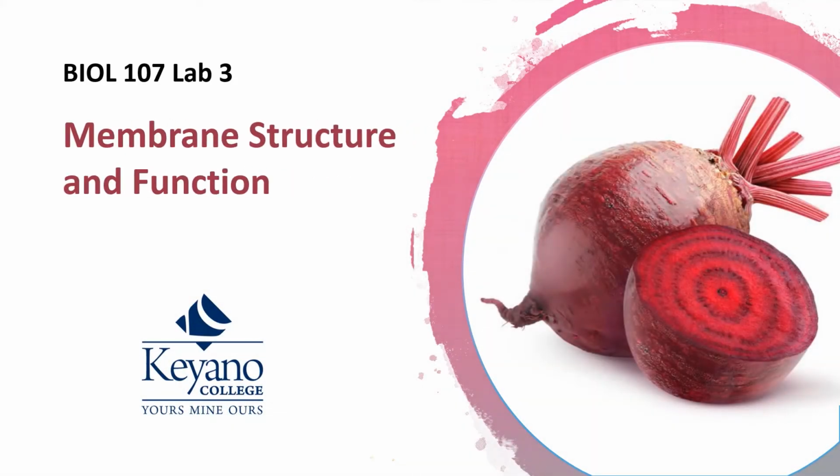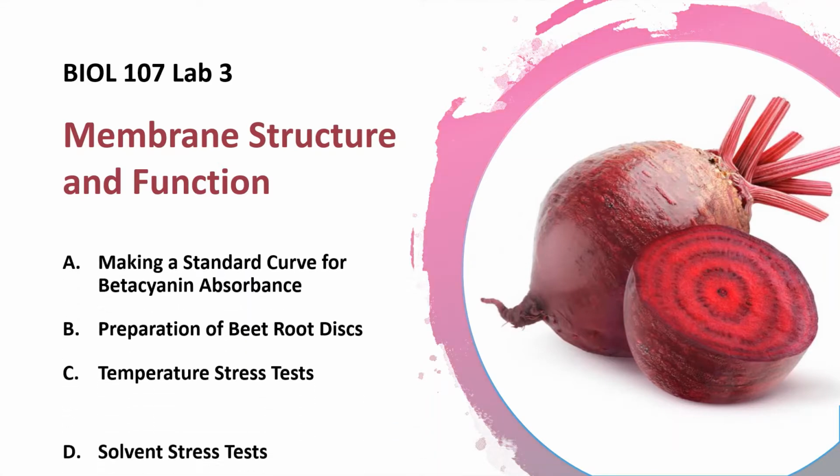Biology 107 Lab 3, Membrane Structure and Function. In today's lab, we're going to be completing 4 exercises. First, we're going to be making a standard curve of a pigment named beta-cyanin. Secondly, we're going to prepare some beetroot discs. And then we're going to do some temperature stress tests on the beetroot membranes and then some solvent stress tests on the beetroot membranes.